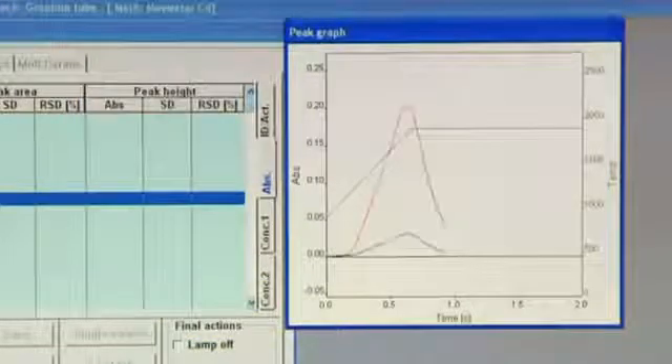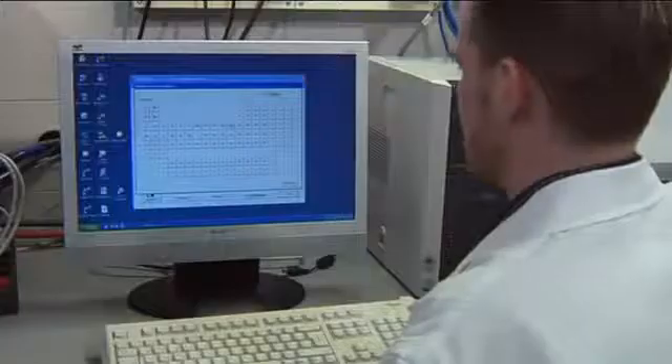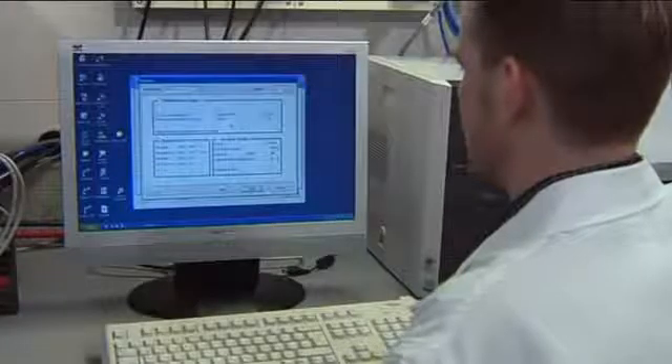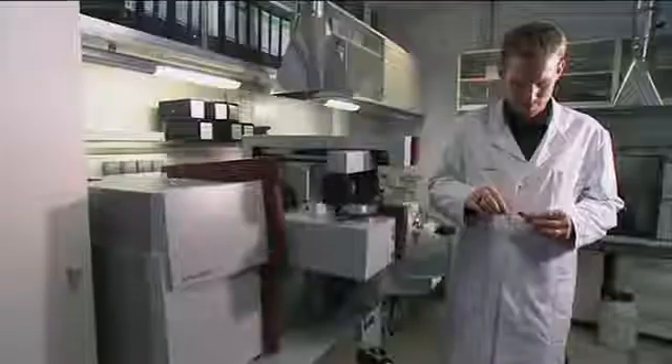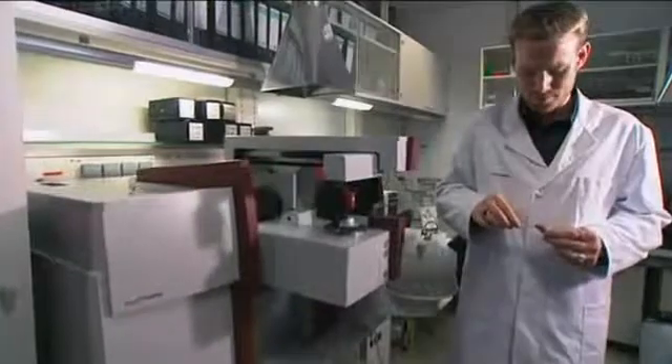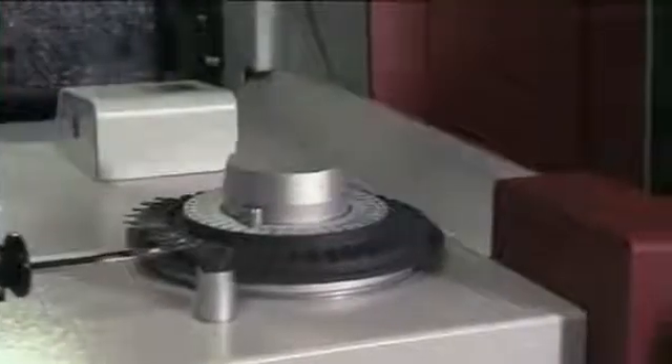Equipped with an automatic solid sampler, the Zenit 700 opens up new ways of analyzing solid samples. With the solid sampling technique, the time-consuming sample preparation can be reduced to comminuting and optionally homogenizing the sample. This minimizes the danger of contamination and loss of material being analyzed. The samples are measured out by hand on reusable graphite platforms.